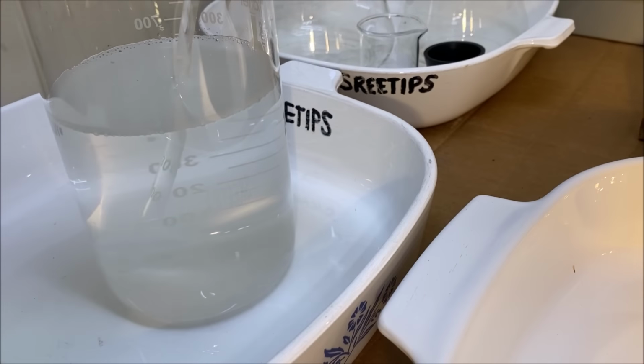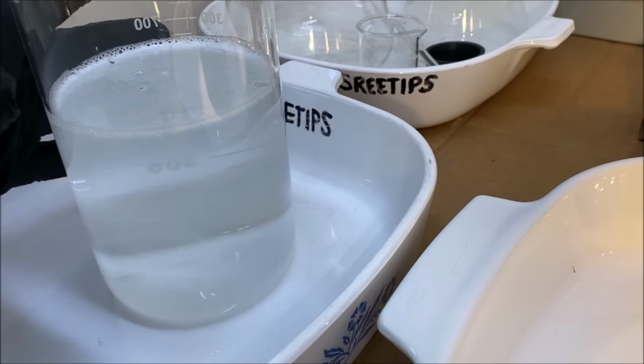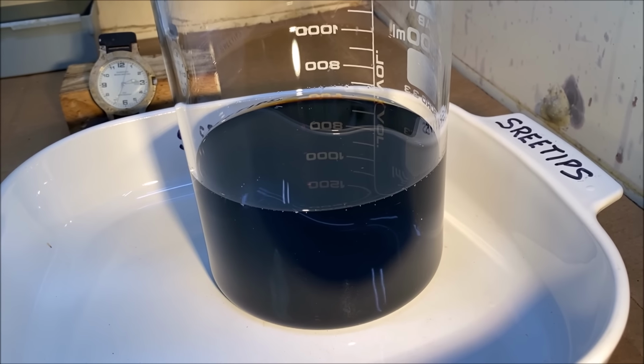Here we go. Let's take our solution of ammonium chloride, and we're going to add it to our platinum solution. See what happens. Should precipitate out the platinum with this ammonium chloride. Here we go.